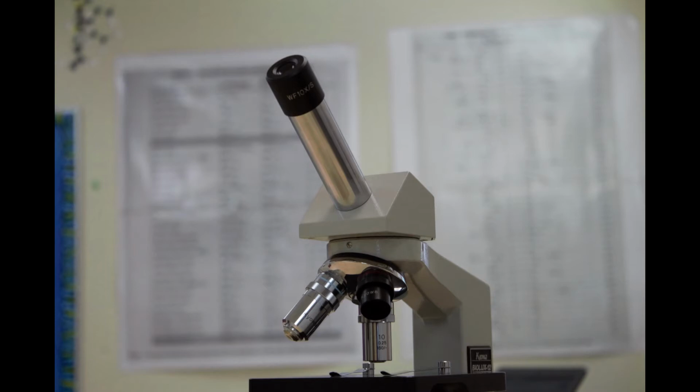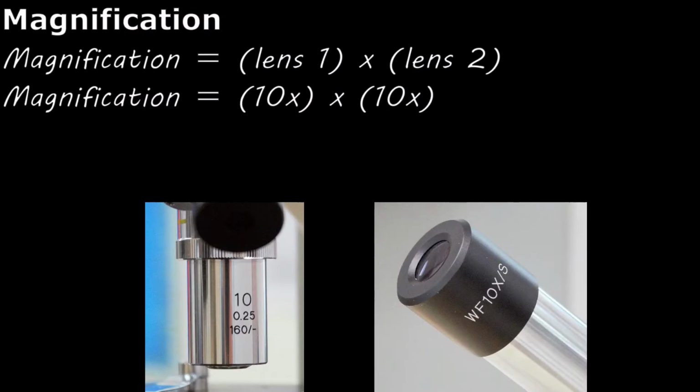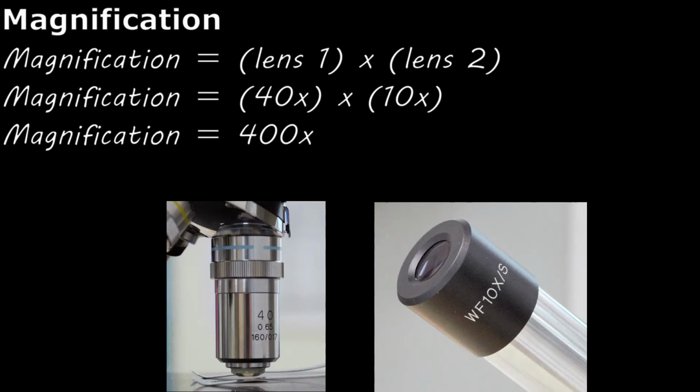When we change the microscope to a medium power, so we're changing the objective lens, we use a 10x objective, but we use the same 10x ocular lens we did before. So 10 times 10, we should get a magnification of 100x. High power uses a 40x objective with the same 10x ocular lens, so we'll get a magnification of 400x.